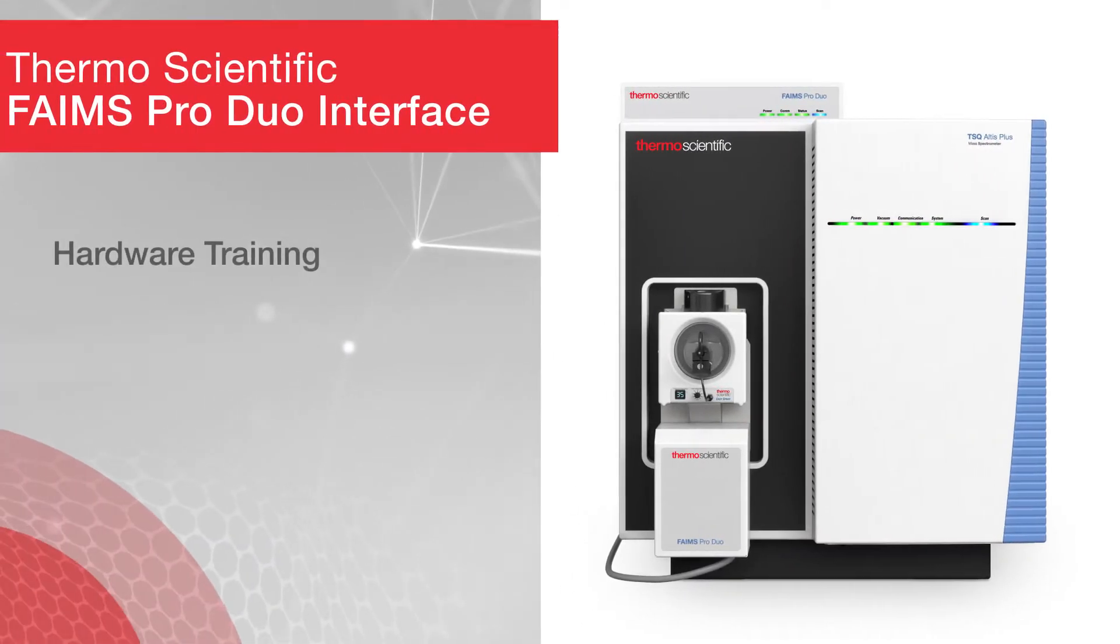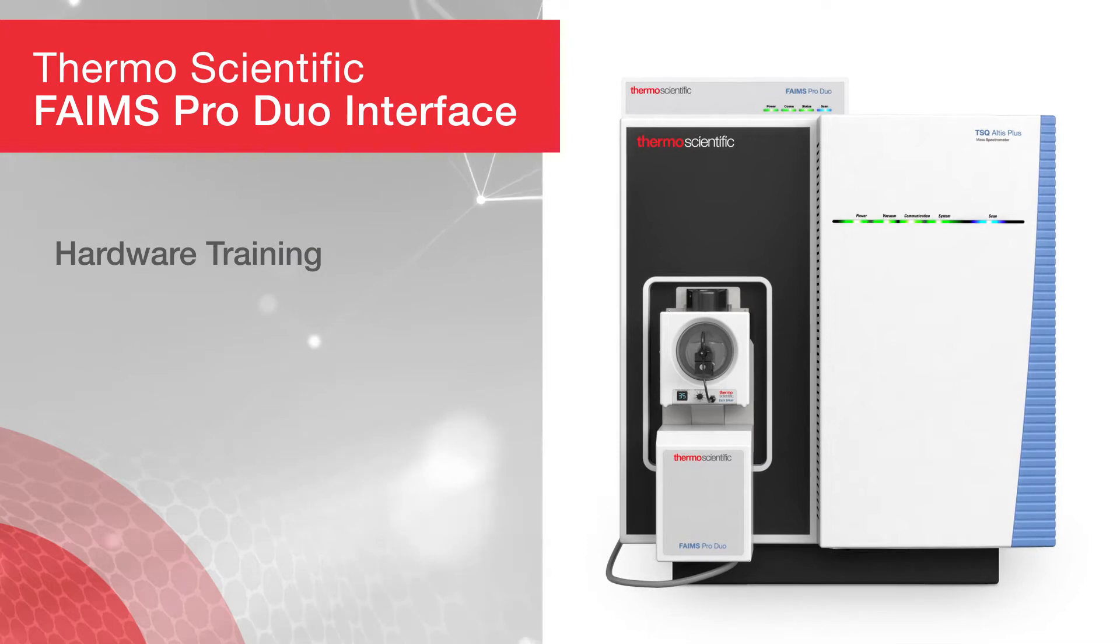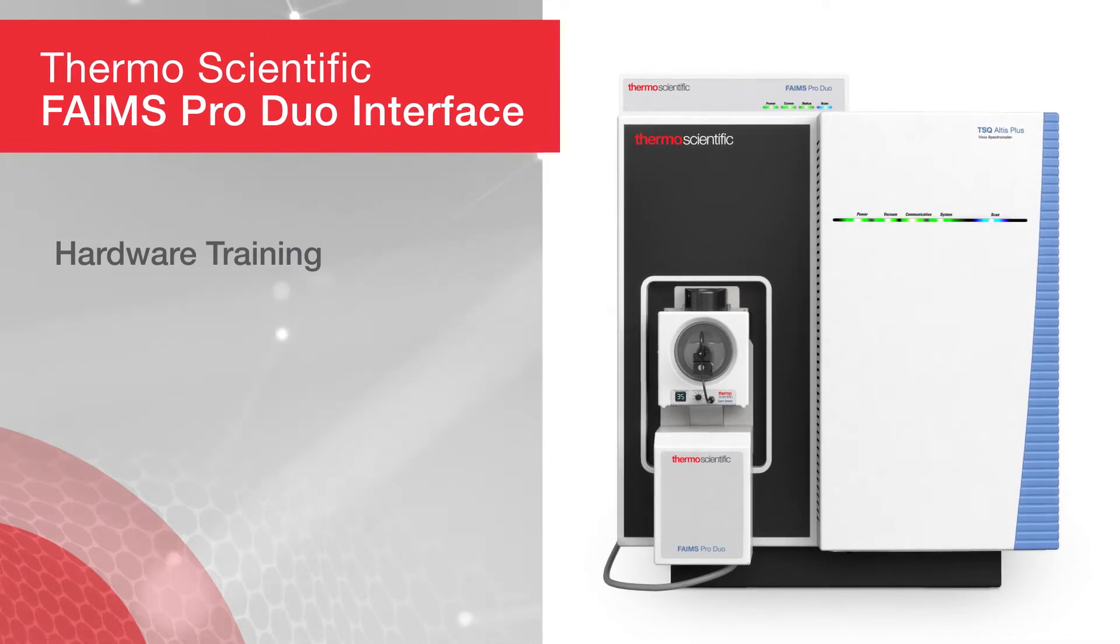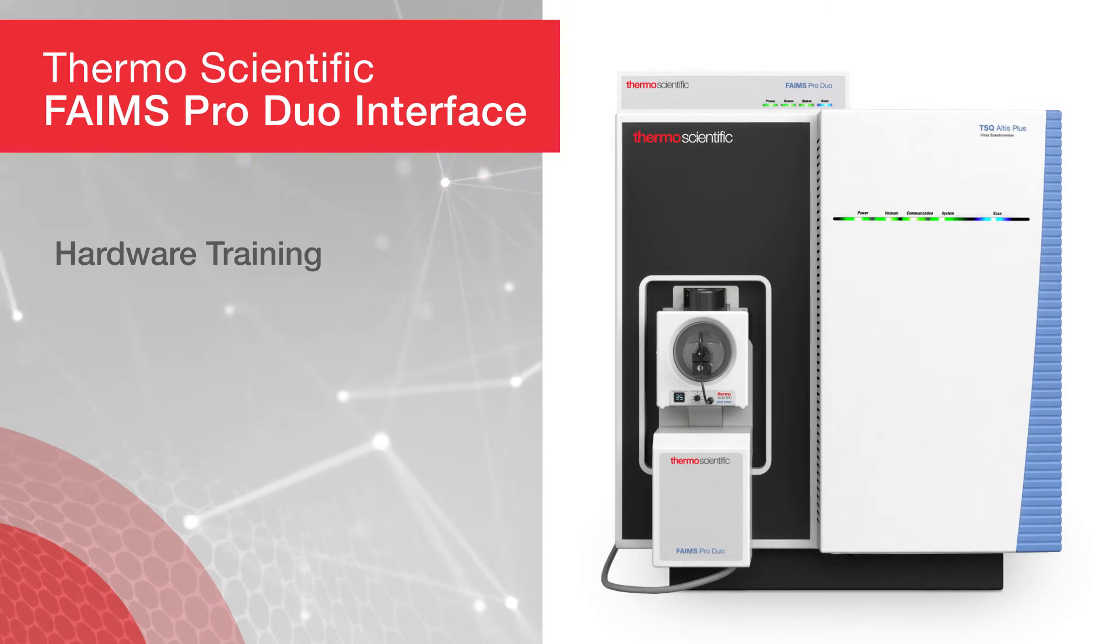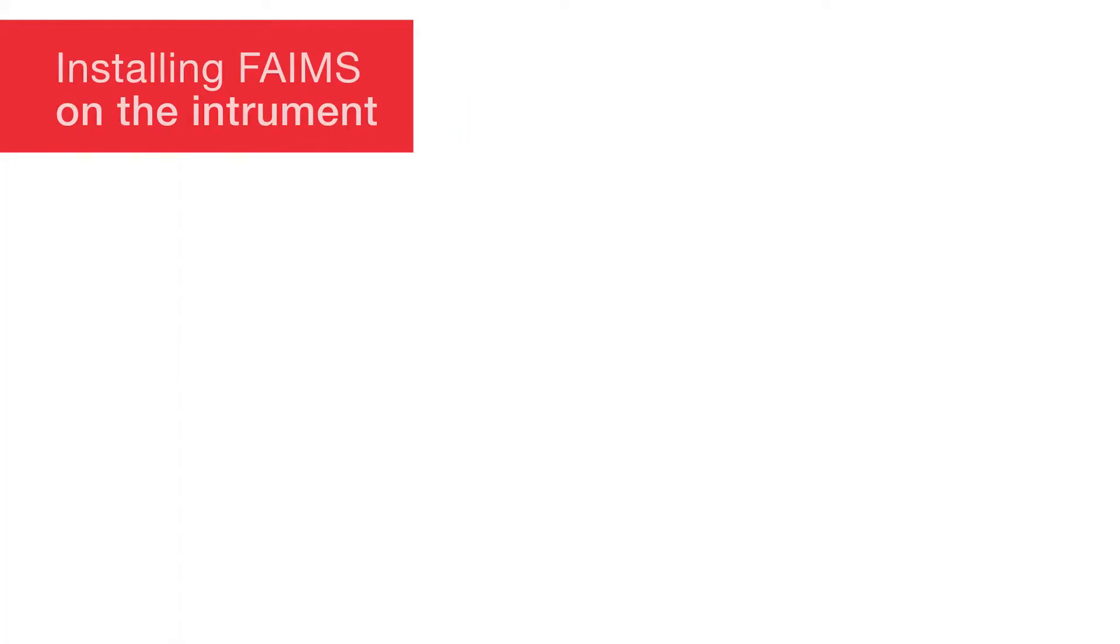FAIMS technology adds another level of ion separation to your mass spectrometer, increasing the quality of your data. Thermo Fisher Scientific's advances in both hardware and software are designed for straightforward installation and optimization of FAIMS.